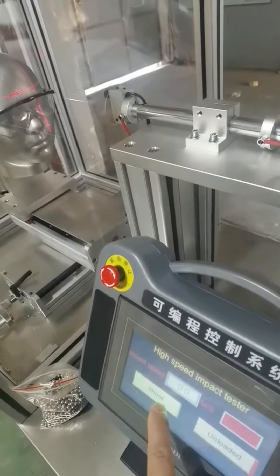Repeat the test for 20 times and observe the damage of the testing sample.